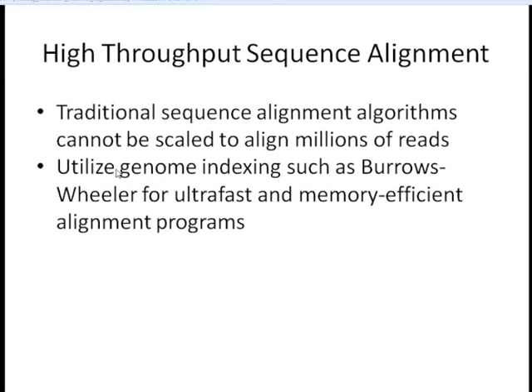Newer programs have been created for short reads and large numbers of reads that first index the genome using indexes such as the Burrows-Wheeler transform, to allow for ultra-fast, memory-efficient alignment of the reads to our reference.